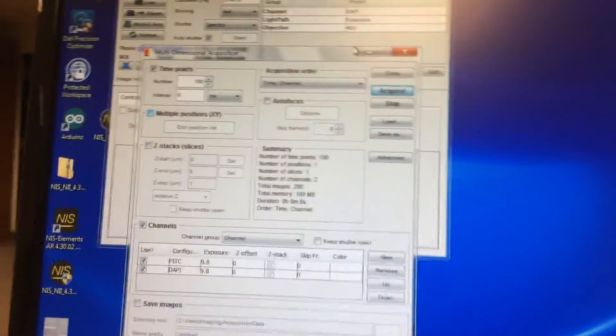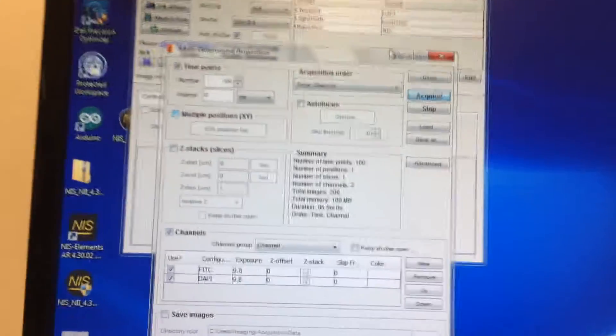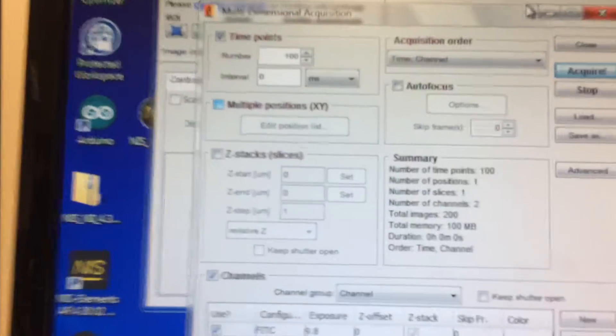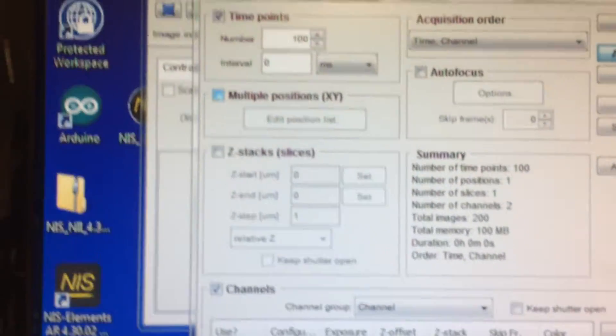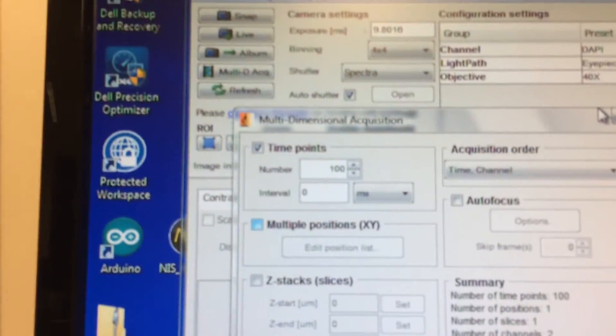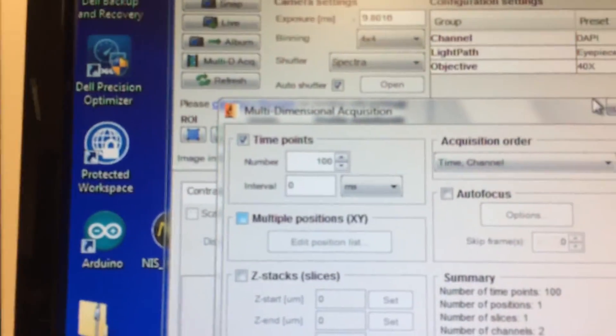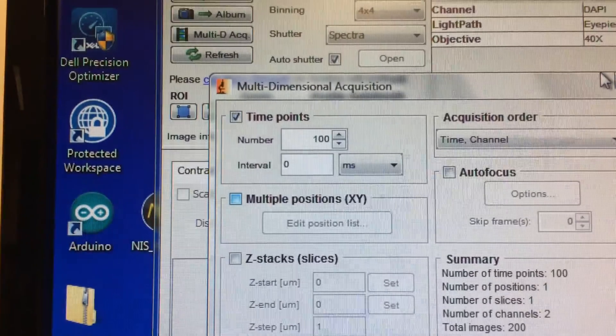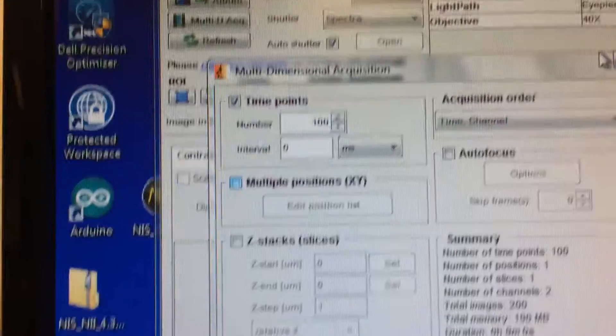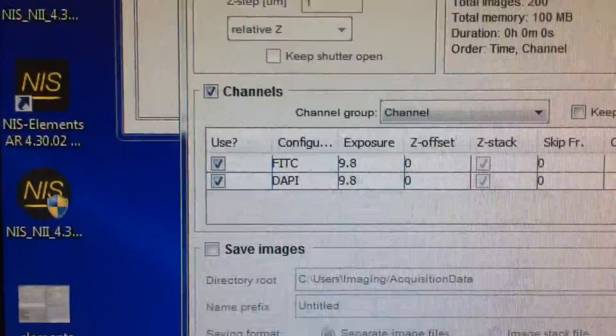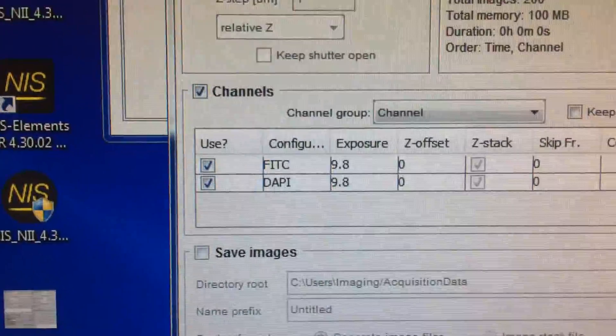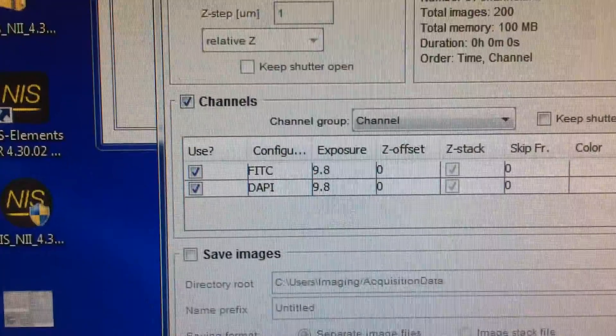Same configuration as Elements, but this time I'm running Micromanager. I'm going to do 100 time points. Exposure time is, in this case, 9.8 milliseconds.